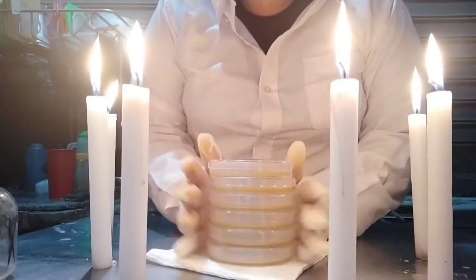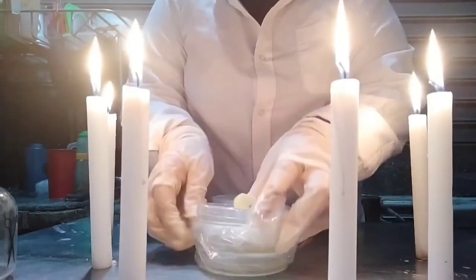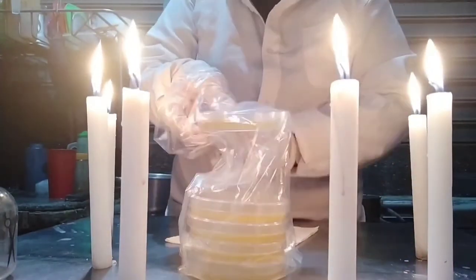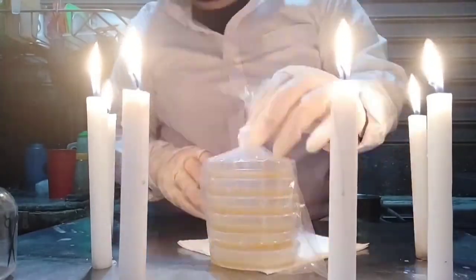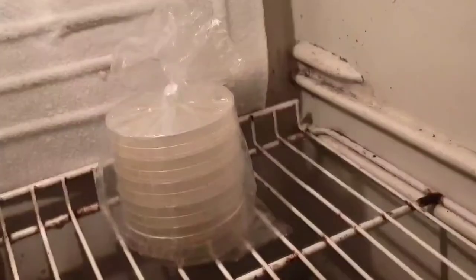Finally, we are packing our petri dishes in a plastic sleeve. Once packed, we refrigerate them for two hours.